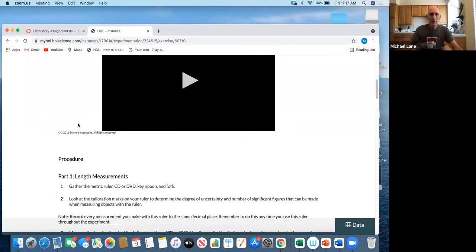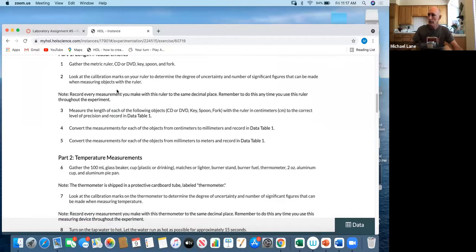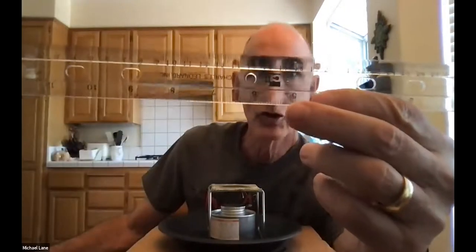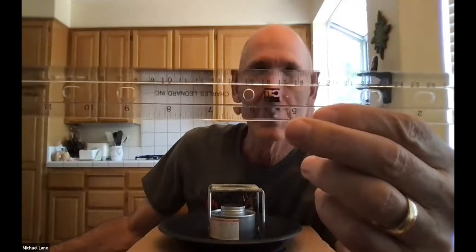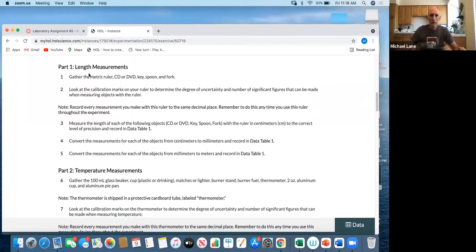So that was the digital scale. I'm not going to demonstrate this further — this is really all about gathering some items. If you don't have those particular items available, then find something else to measure. It says to look at the calibration marks on your ruler. This device has measurements to the nearest millimeter, so you should record things to the nearest tenth of a millimeter as your estimate, as we have discussed.